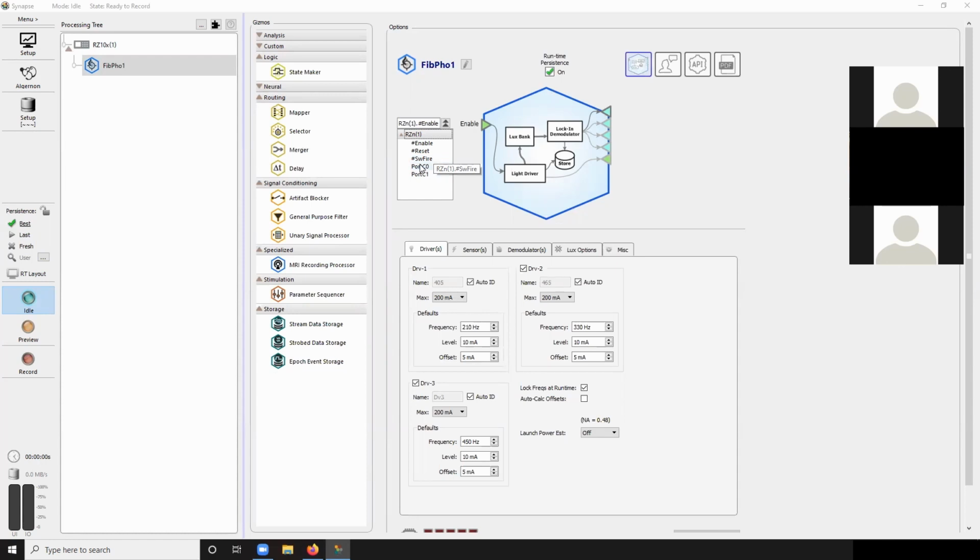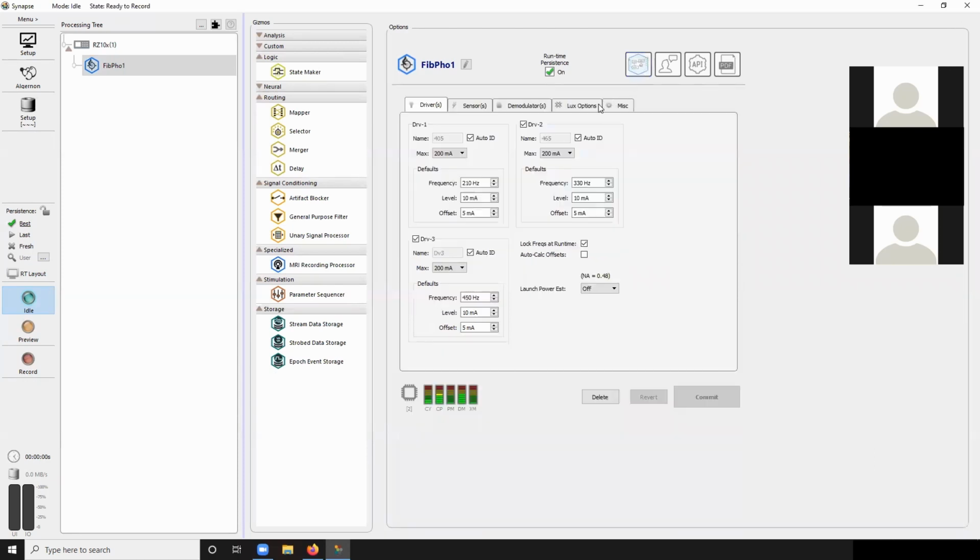And then these are your digital inputs. And those are the only available connections to you because this requires a logic input. And those are the only logic signals available. So that's that. Now, the difference between this blue and green here, by the way, this green is logic. This is a floating point signal. This is sort of getting into the weeds a little bit, but that's a little bit about what this picture is and why it matters.